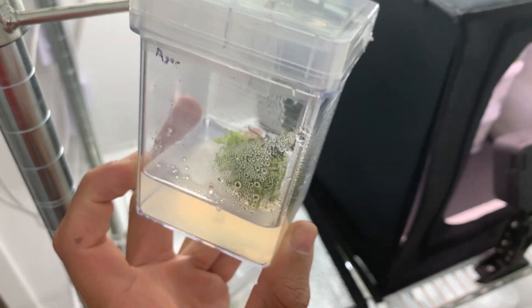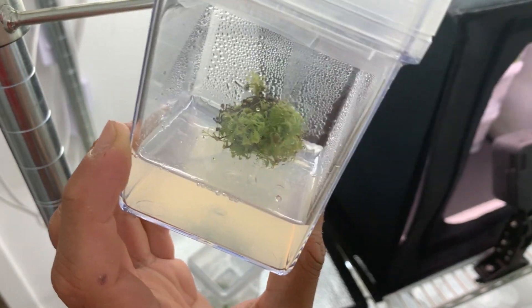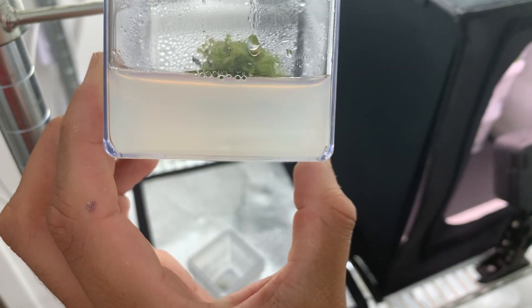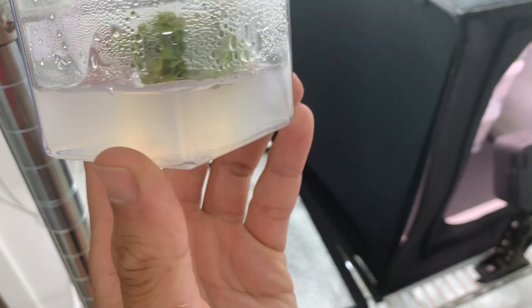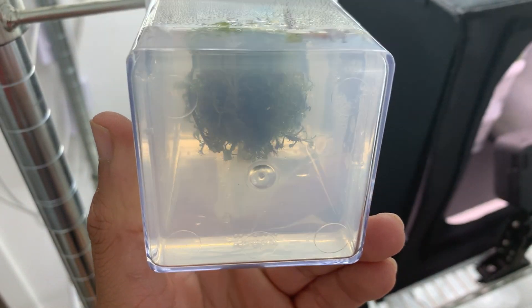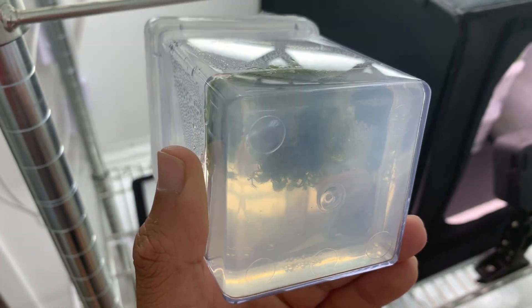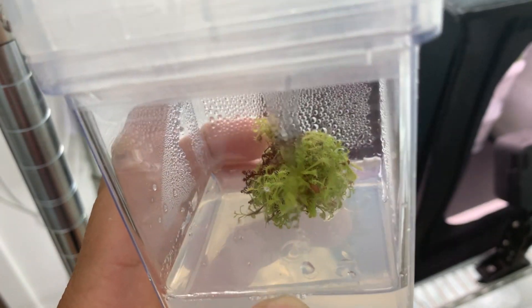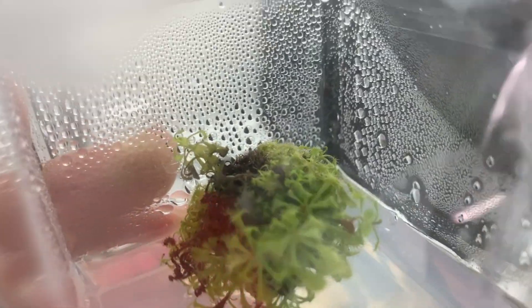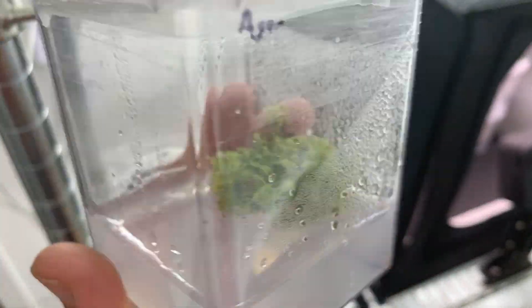Let's move on to the one with agar, because this one is actually very exciting. There is absolutely no contamination whatsoever — it looks very clean, no bacteria or fungus, nothing at all. The plant looks very good and they're starting to grow. There are some dead plants in there, but that was from before.